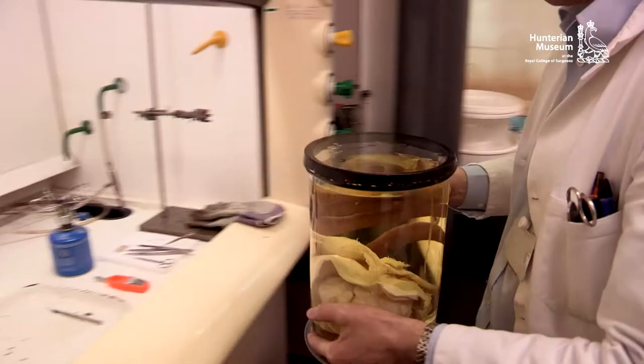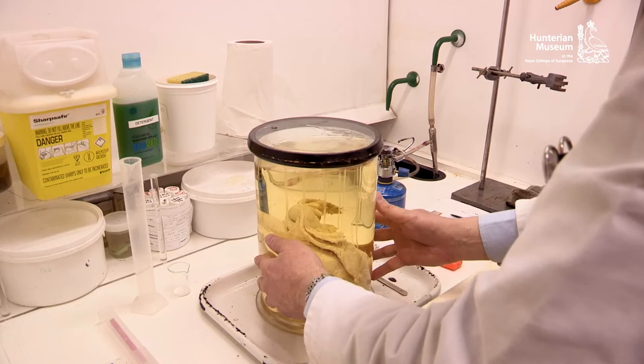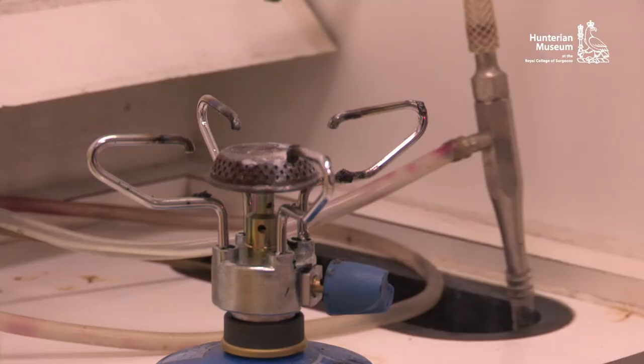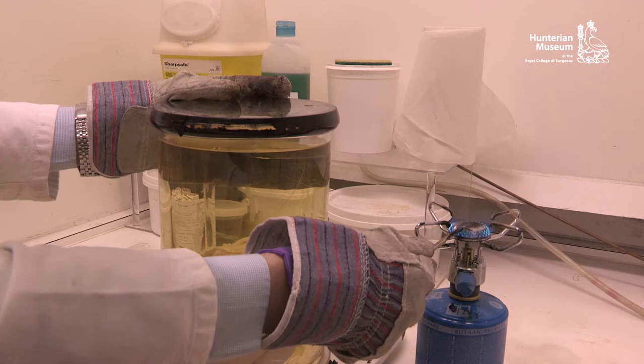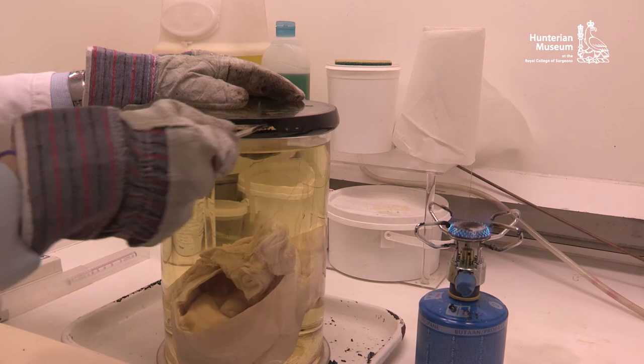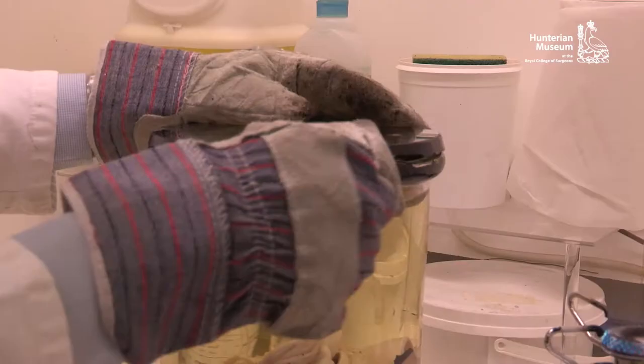The removal of a pitch or tar seal should ideally be carried out with fume extraction. It is best to use a sharp scalpel that has been heated in the flame of a Bunsen burner or similar. The aim is to melt the pitch with the heated scalpel in order to soften the seal and to work around the rim of the jar with a cutting motion. Regular reheating of the blade is essential to obtain a good result. The cutting process should never be rushed, as this may lead to the glass lid cracking.